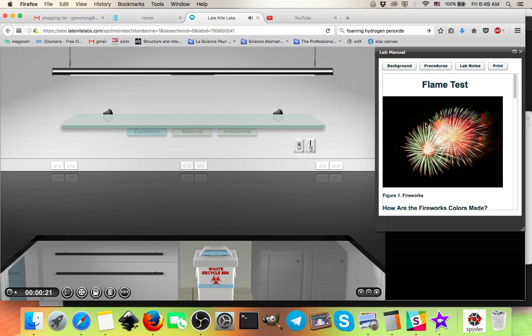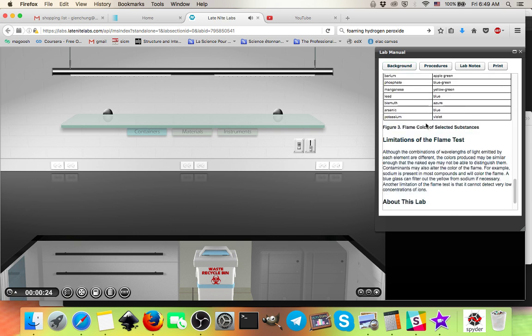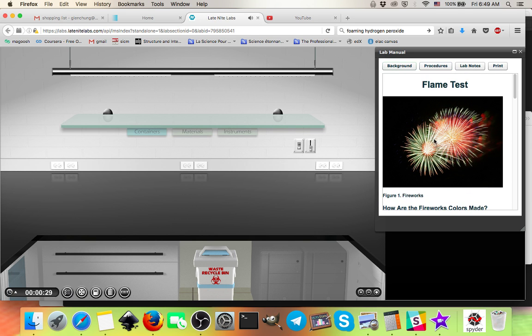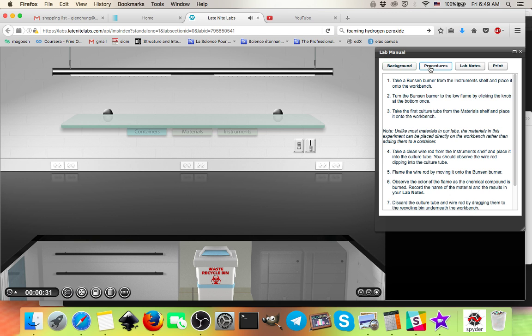The first page is the background. I do not require you to read this, although some of you may find this interesting. I did not write this. And then you may click on the Procedures button. This you must read. This tells you how to do the work here. And this is how to do it.